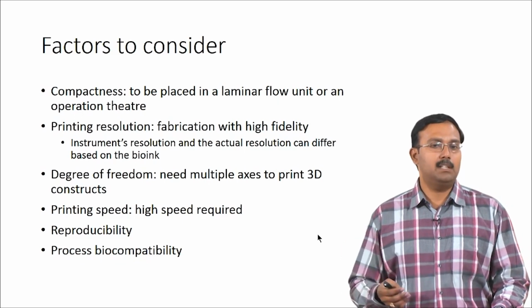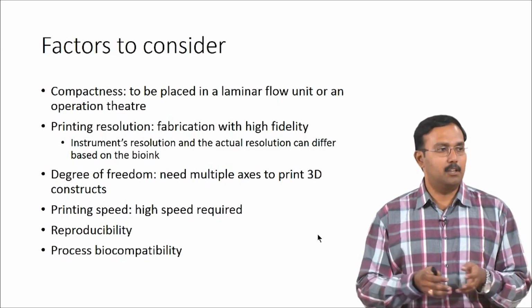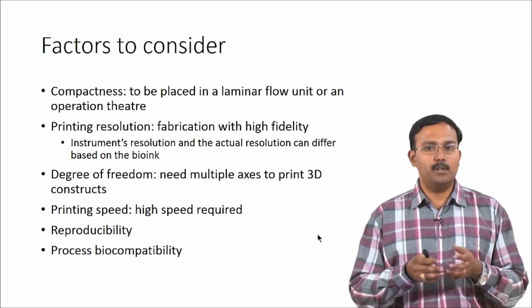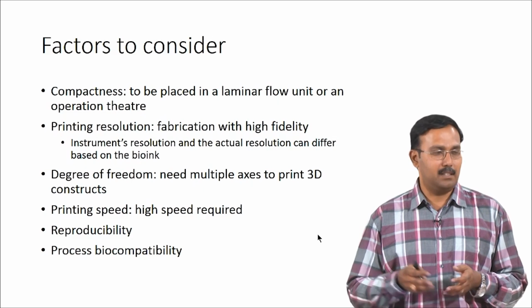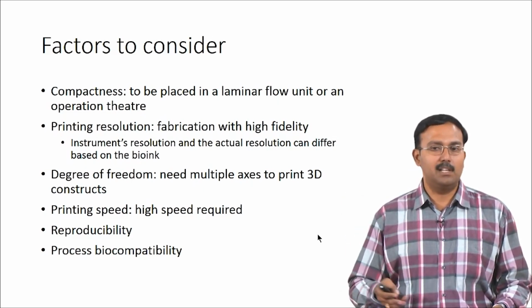Biocompatibility of the ink is one thing, but the process itself can actually kill the cells, right? For example, shear or temperature. With inkjet, if you are going to use a thermal kind of DOD, then there can be high temperatures used which could kill the cells.